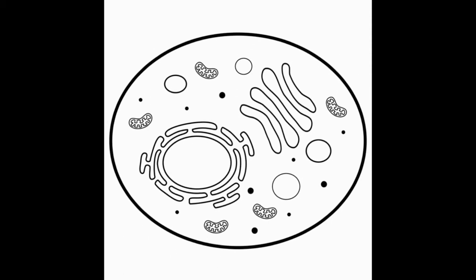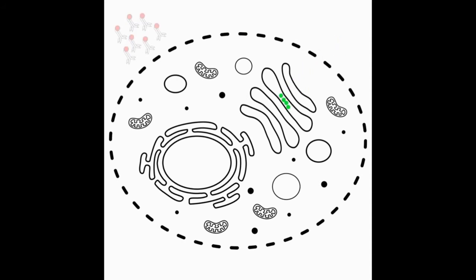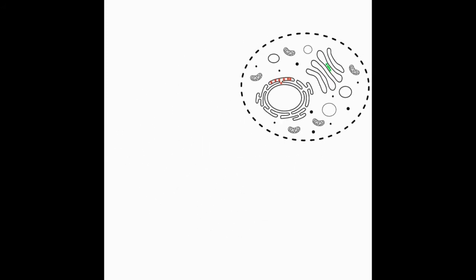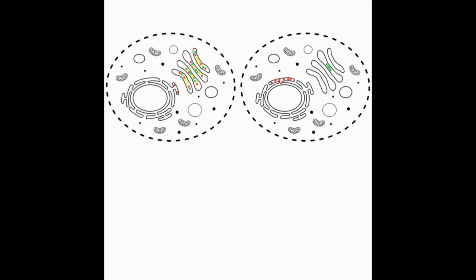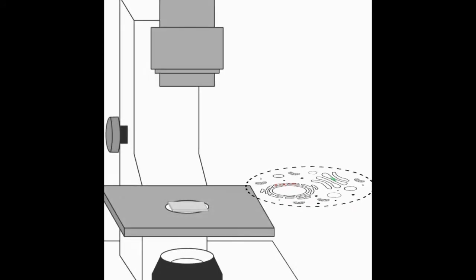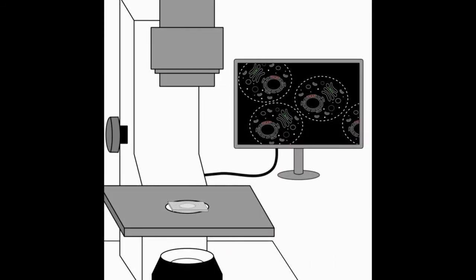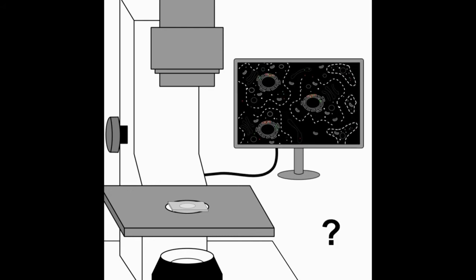Companies can make antibodies specific for almost any protein, whether on the cell's surface or inside the cell. Using different antibodies labeled with different fluorophores allows us to see where different proteins are in the cell. In this way we can check whether two proteins are in the same place at the same time or not. Scientists call that colocalization. Spatial information like this is often important to figure out what a protein does or to find out what goes wrong in a disease.